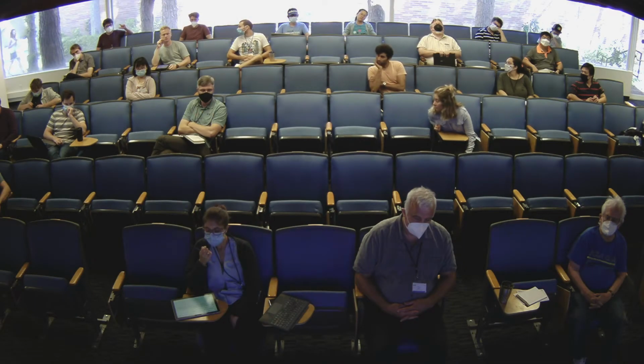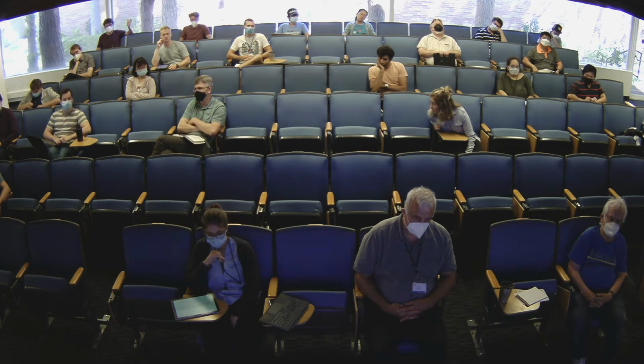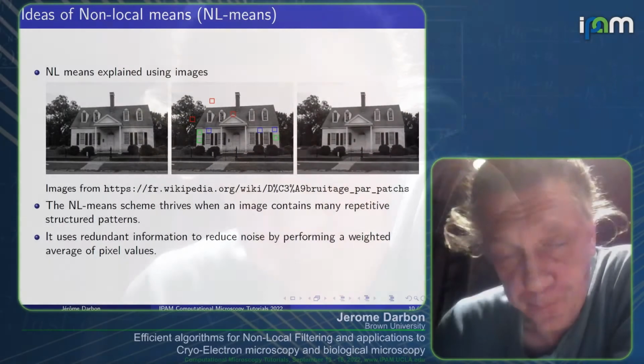So in other words, is there a soft criterion for similarity? Because we're talking about images that contain noise. So what's the criterion that says similar? It's not exact pixel values. For sure. I'm going to tell you that right now. But essentially, you should see it as the square of the difference of two patches. Thank you. That's it.